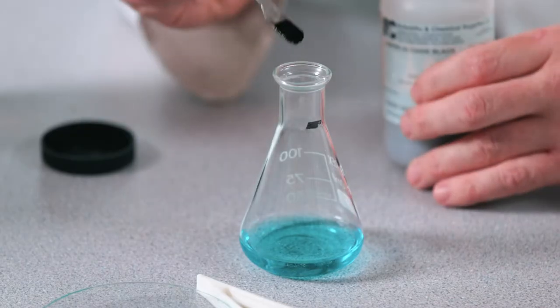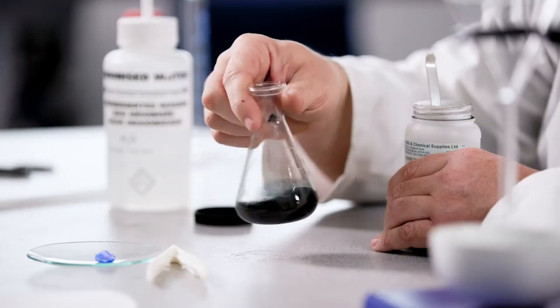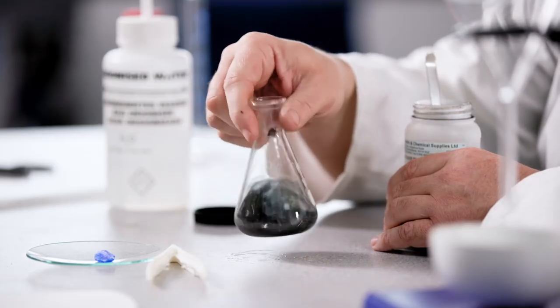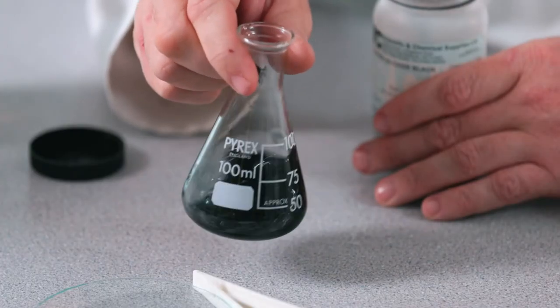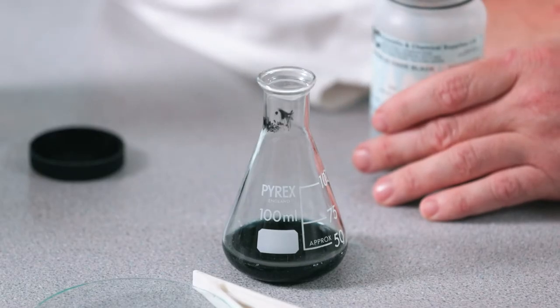Keep adding half spatula fulls of copper oxide to the reaction mixture with swirling until unreacted copper oxide remains in the conical flask. This will indicate that the copper oxide is now in excess, and all the sulphuric acid has reacted.